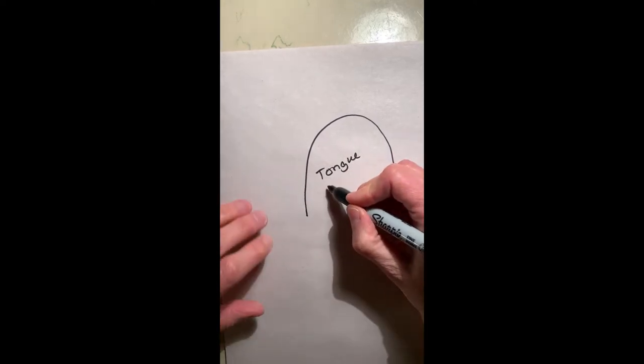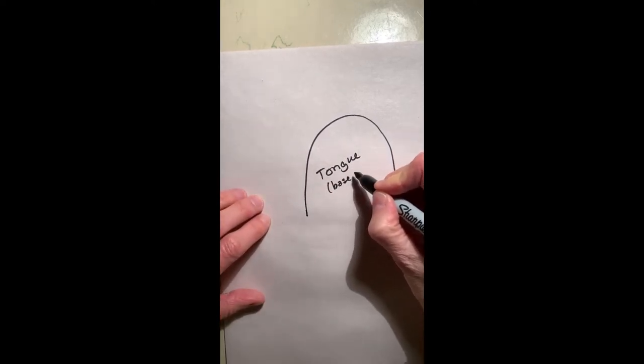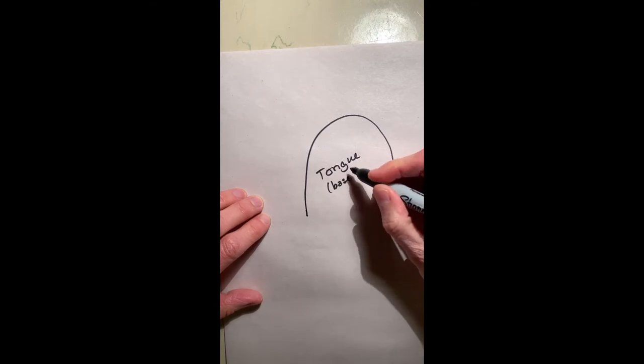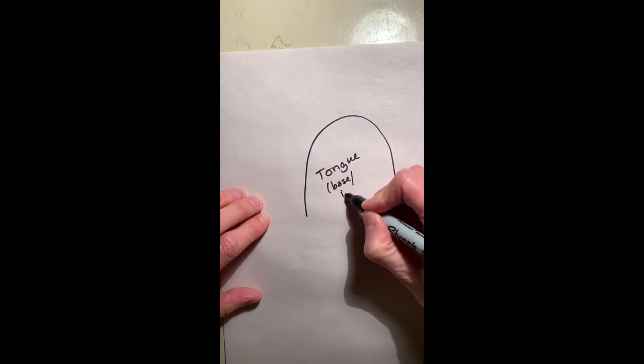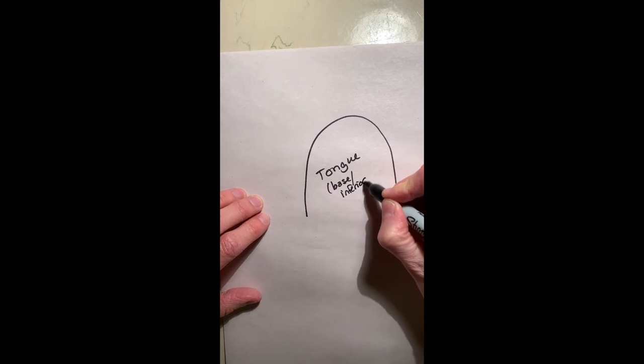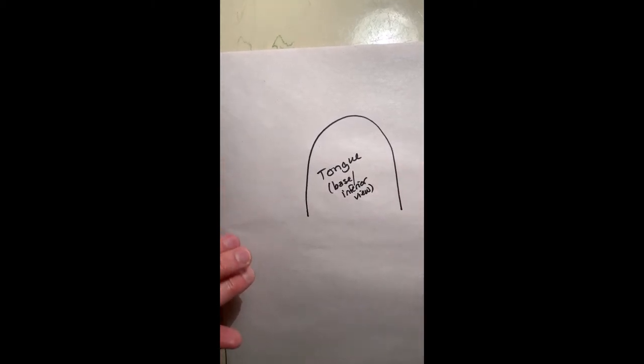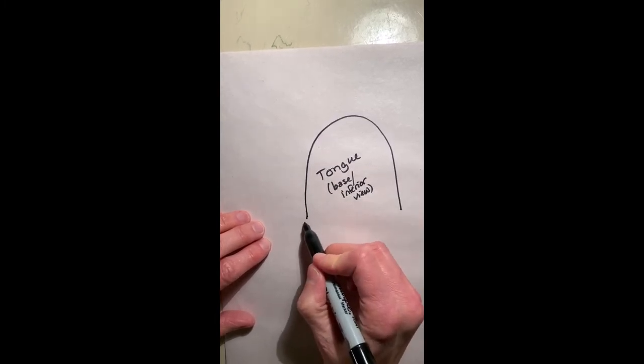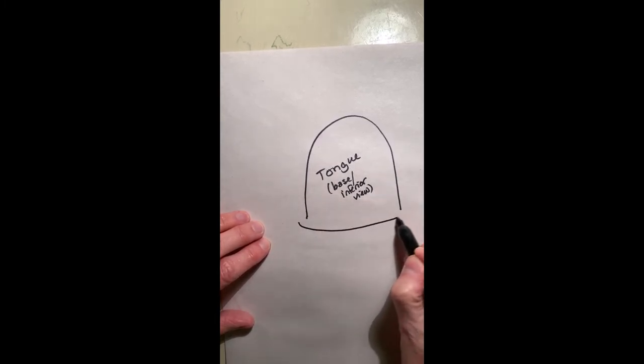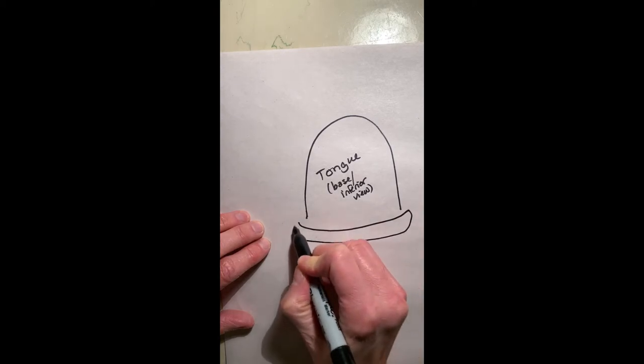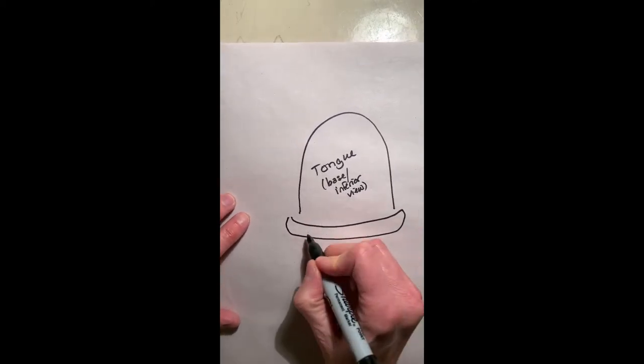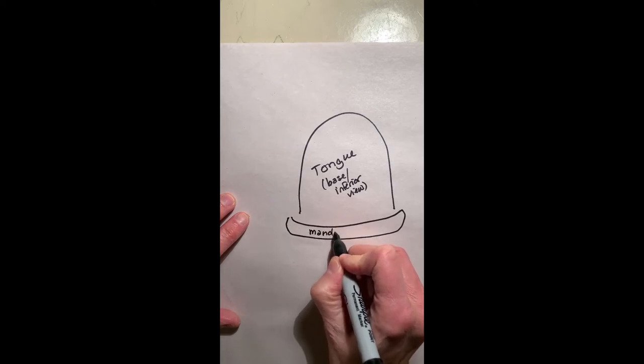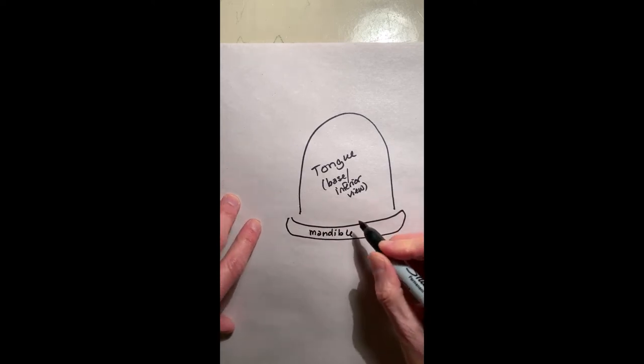So if you look at the tongue, this is the base or underneath, or we could say this would be from the inferior view. Pretend we're looking underneath the tongue, and we can see that the tongue is attached to the mandible, the jaw.